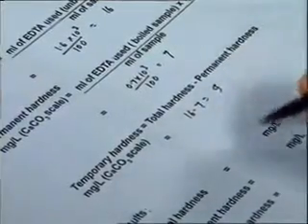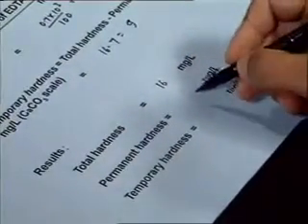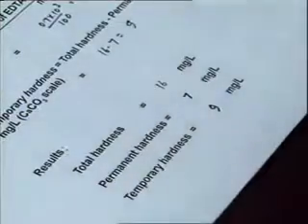So we can conclude that total hardness of this sample is 16 mg per liter, and permanent hardness as 7 mg per liter and temporary hardness to be equal to 9 mg per liter. Total hardness can also be determined from the concentration of different metallic cations. Most often the cations taken into account are calcium, magnesium, iron, aluminium, zinc, barium, strontium and manganese.